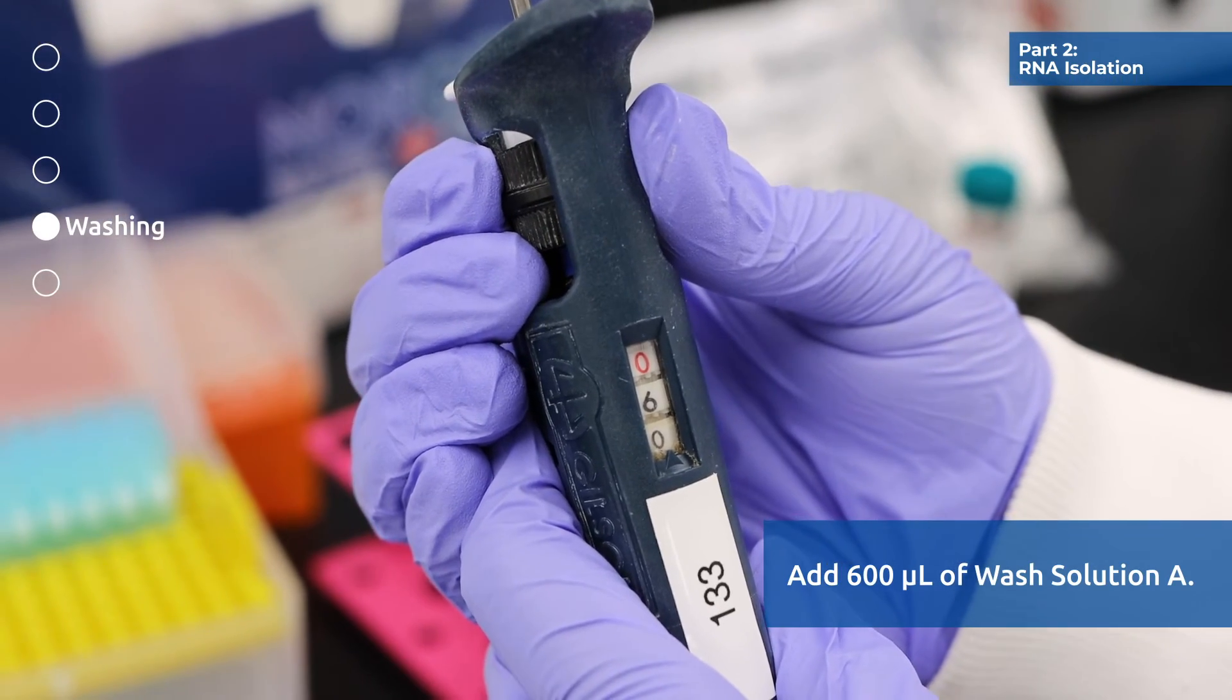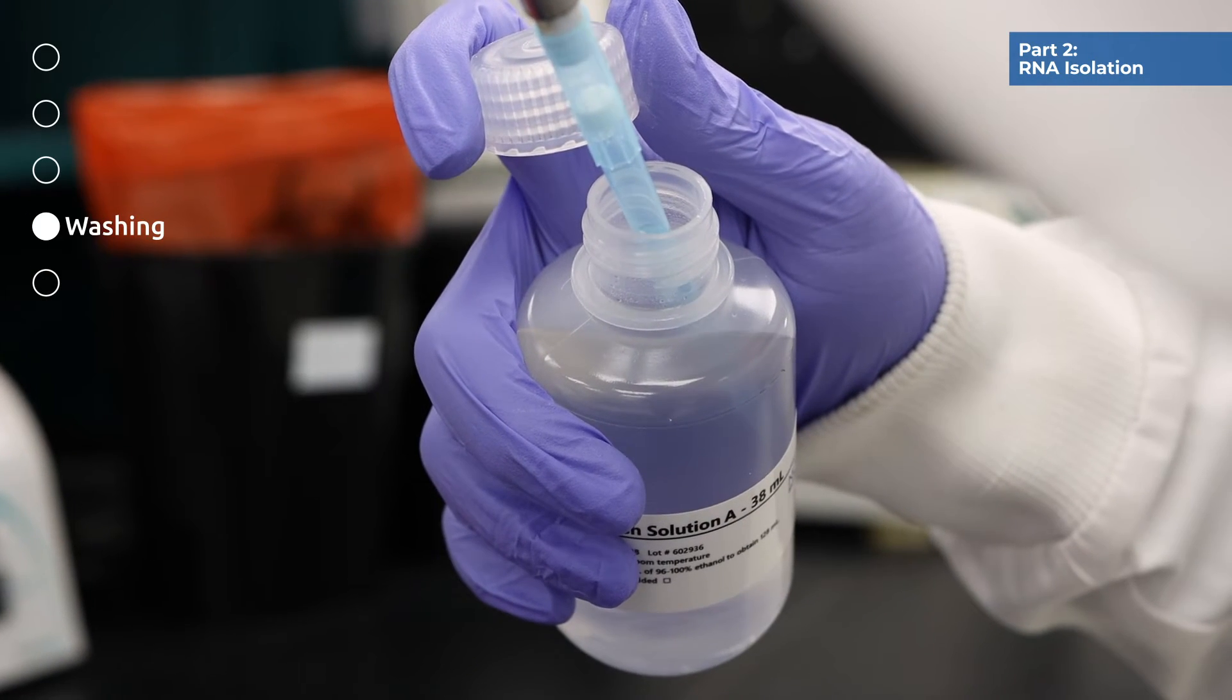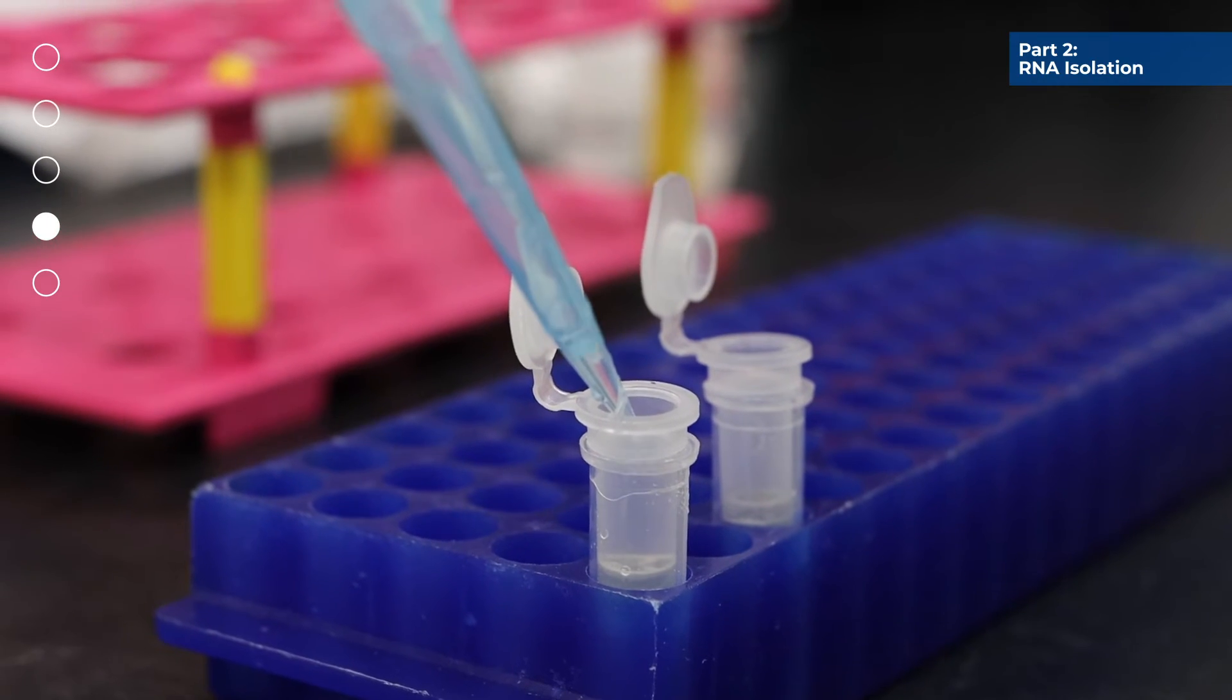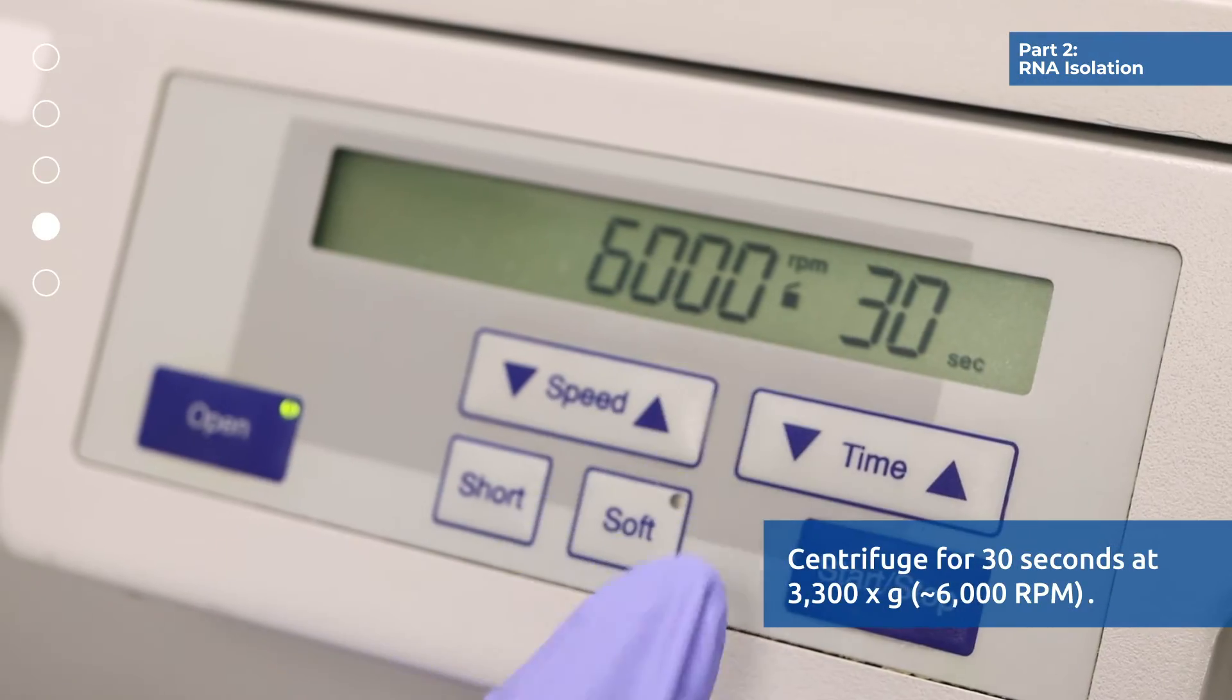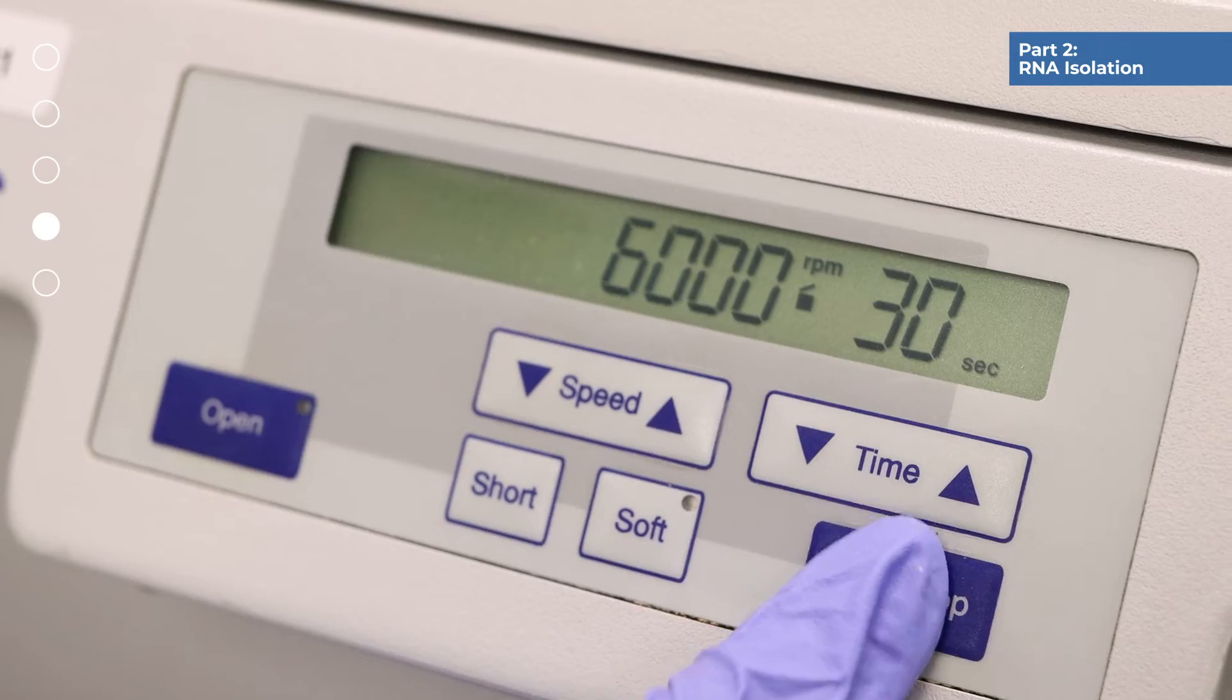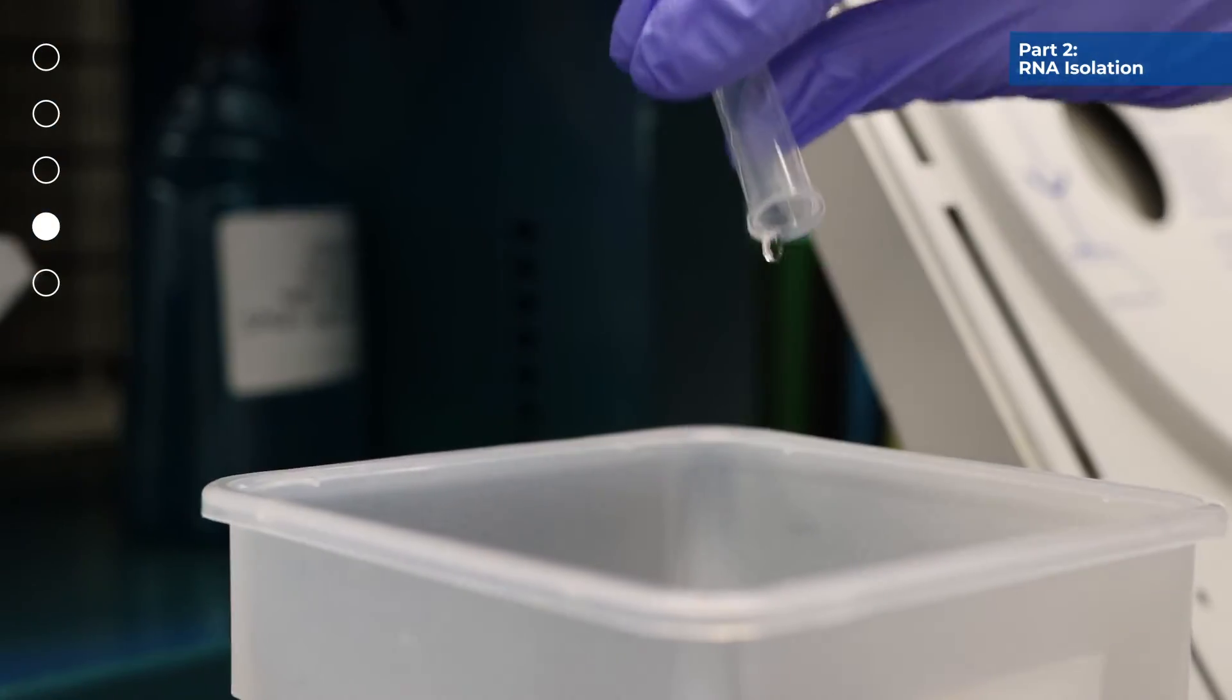Apply 600 microliters of wash solution A to the column and centrifuge for 30 seconds at 3300 g or 6000 rpm. Discard the flow-through and reassemble the spin column with its collection tube.